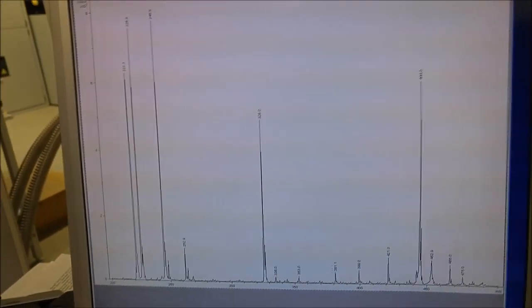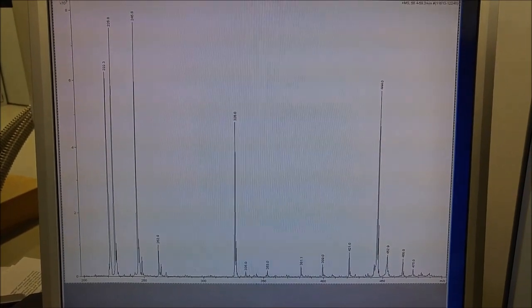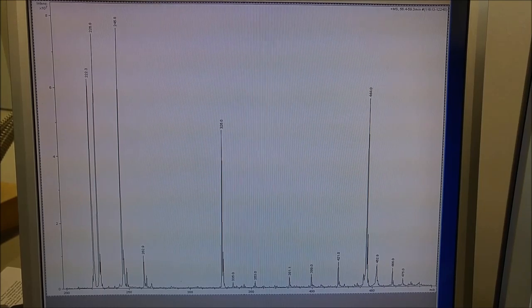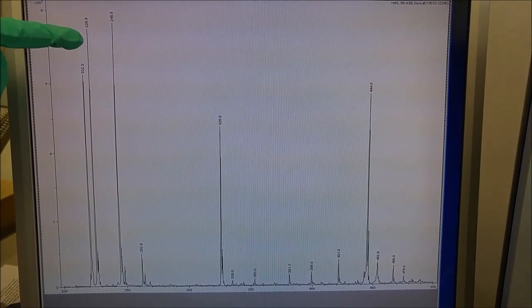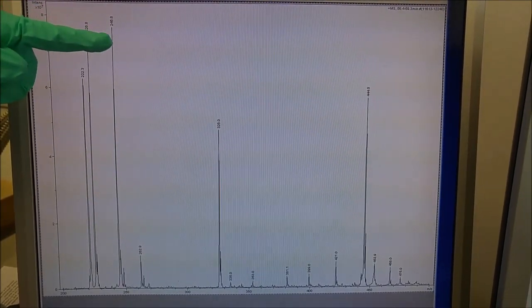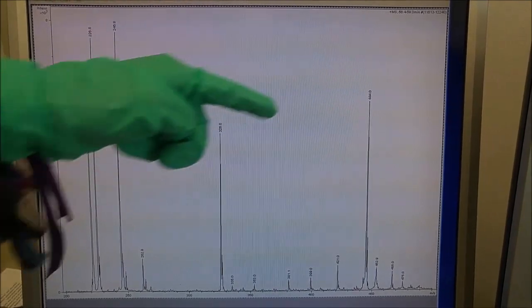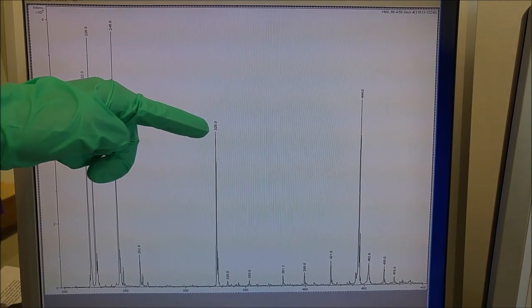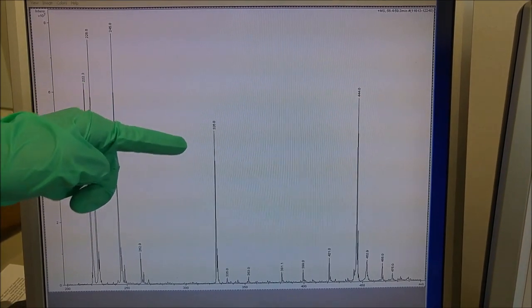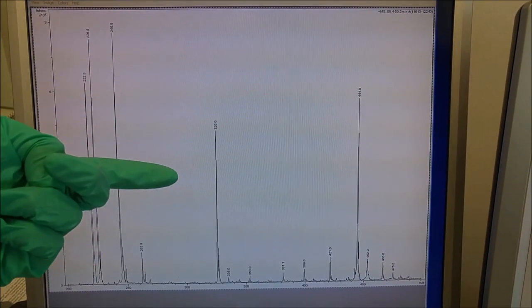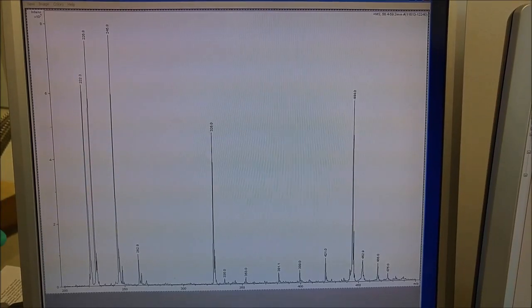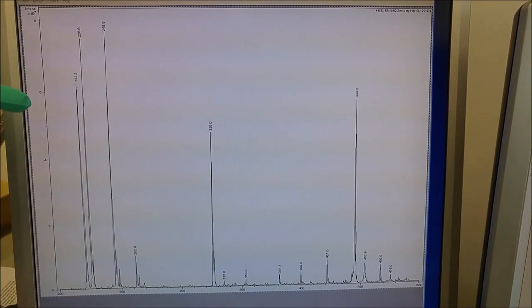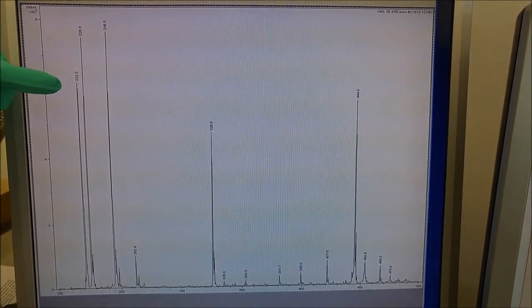And if we average a specific time point of the total ion chromatogram, we obtain a mass spectrum where we can see the trans-cyclooctene as a peak here, the tetrazine as a peak here, the final product as a peak here, a product here which is a fragment of the final product being formed in the ionization process, and also a doubly charged molecule of the product being manifested as a peak here.